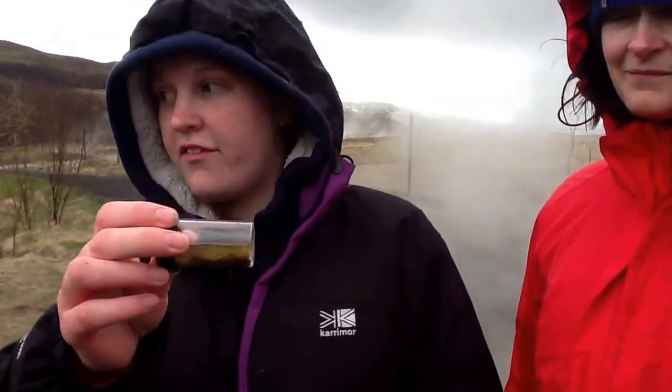So what have you been doing here? Here we have been collecting some algae samples. We just scrape them off the rocks, and it's really hot water. The range is 80 degrees C to 40 degrees C. So we're going to see if they have different rates of photosynthesis to algae in the tank.